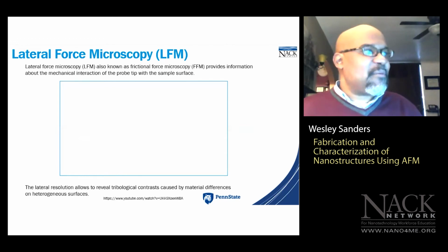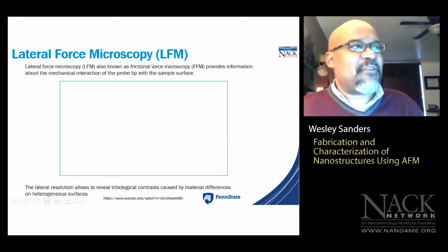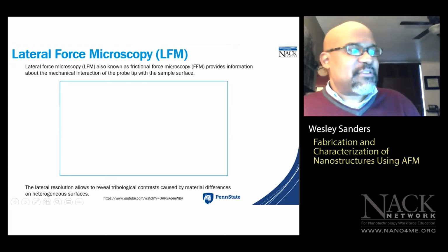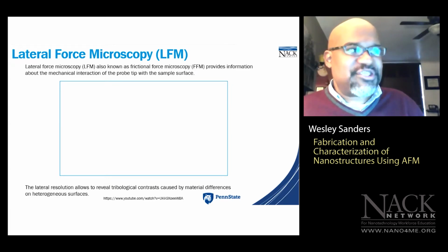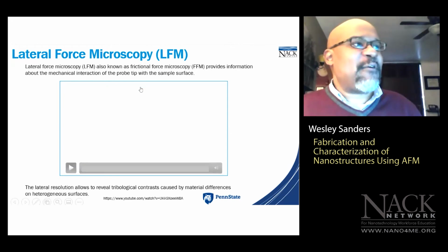So I'm going to start with lateral force microscopy, also known as frictional force microscopy. What I'd like to do is play a very short animation that will provide you with a visual as to how LFM works.